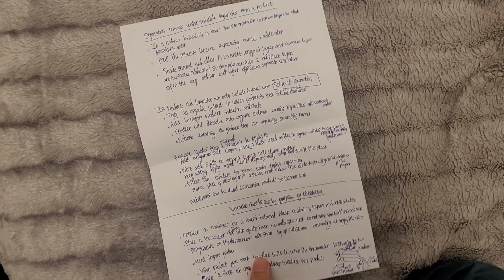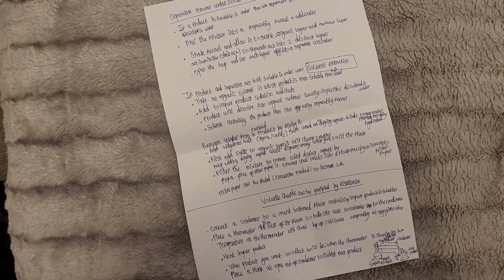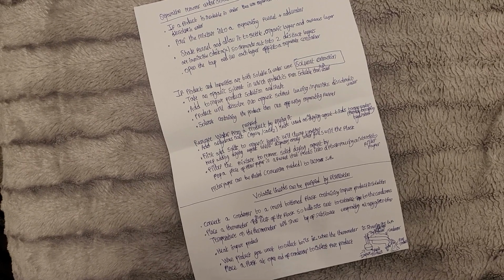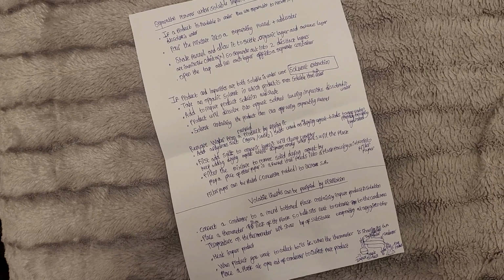Remove water from a purified product by drying it. So we need to add an anhydrous salt, magnesium sulfate, MgSO4, or calcium chloride, CaCl2, the two most common ones. They're used as a drying agent, and what they do is they bind to any water present, becoming hydrated.